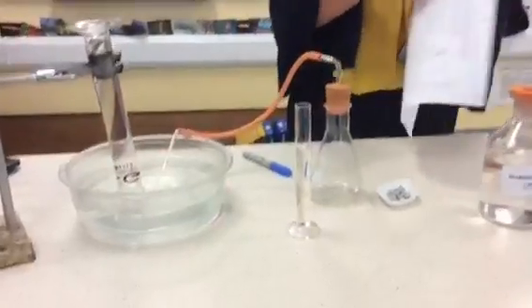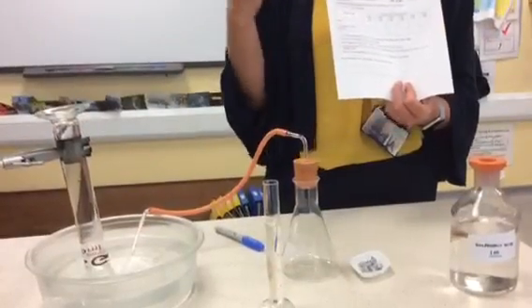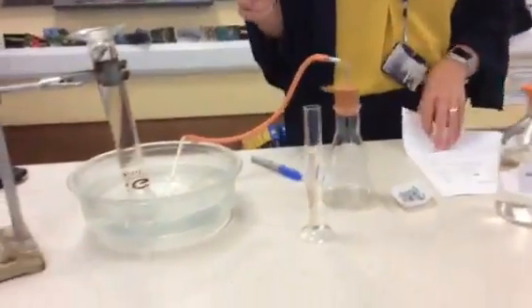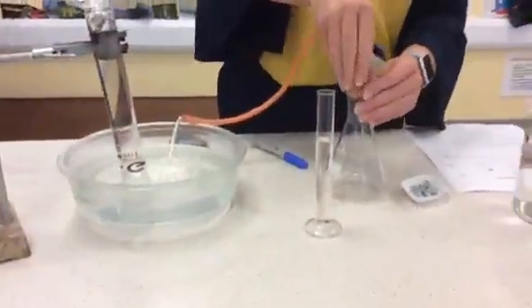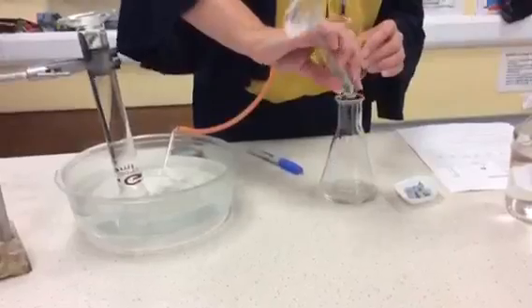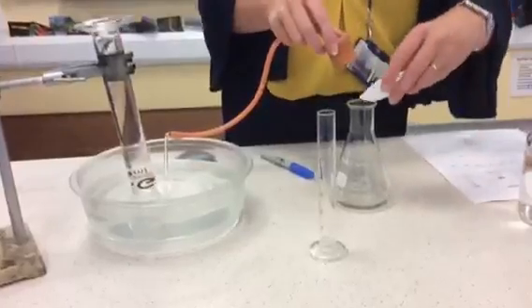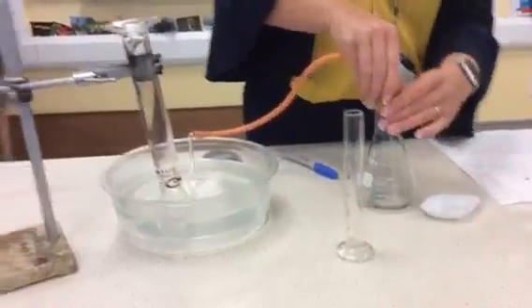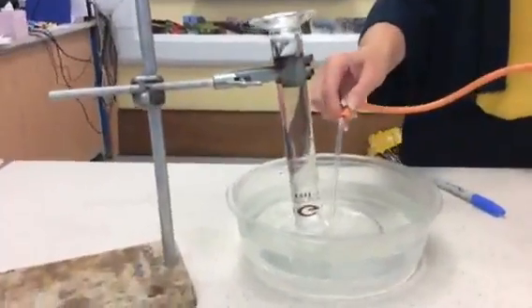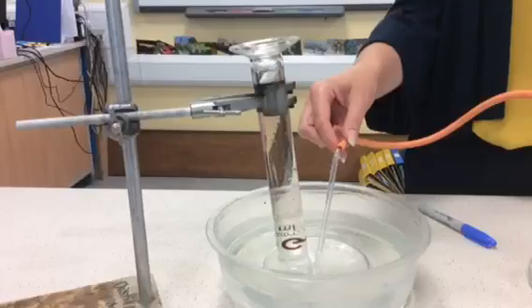So we're going to measure every 30 seconds, see the volume of our gas, and then do the exact same experiment but with a catalyst and see if the volume of gas differs. Okay, so if we get started. First of all, I'll put the 25 ml of acid into the conical flask. Remember, we're on 0 at the top here for our measuring cylinder, and then we'll put in our 5 pieces of zinc, put them on, and then start our stopwatch. And then remember, we're timing every 30 seconds to record the volume of gas that's produced.